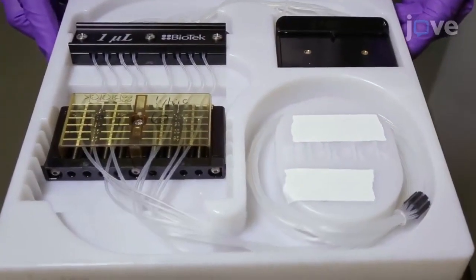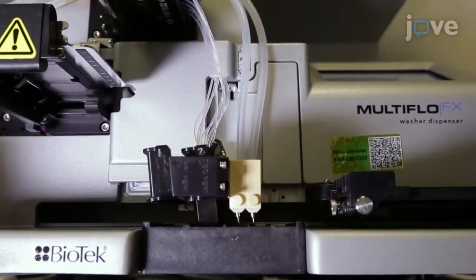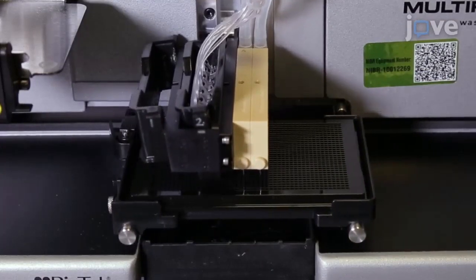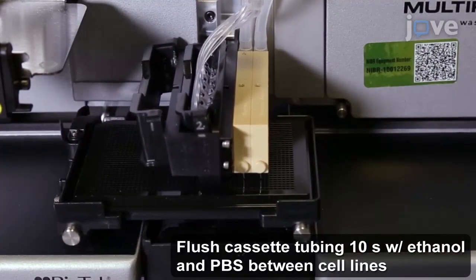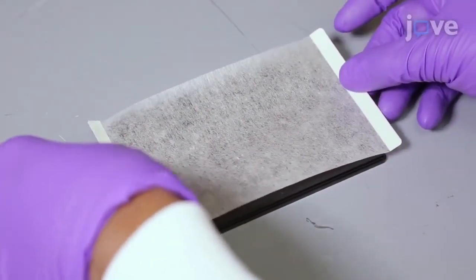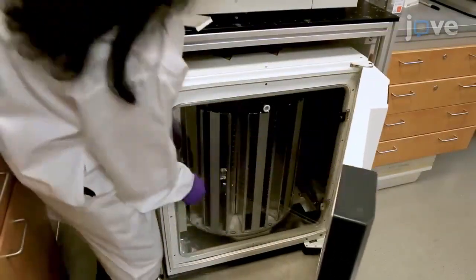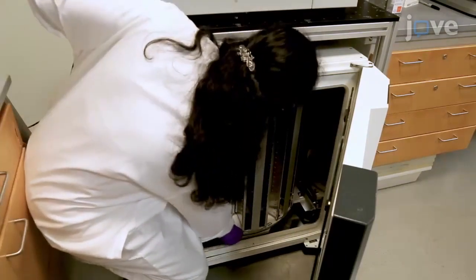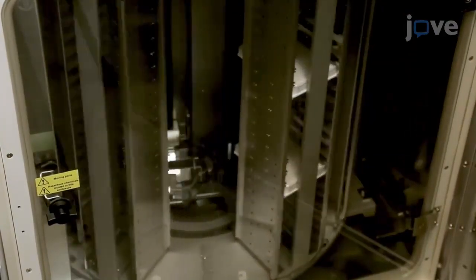Use a sterilized, small stainless steel-tipped cassette with a peristaltic pump-based system to seed a total of 500 cells in eight microliters of spheroid medium into each well of a 1536-well tissue culture-treated plate. Then use a breathable adhesive plate seal to cover the plates, and place the plates in a spinning incubator set at 37 degrees Celsius and 10 rpm with 5% carbon dioxide and 95% relative humidity for three days.